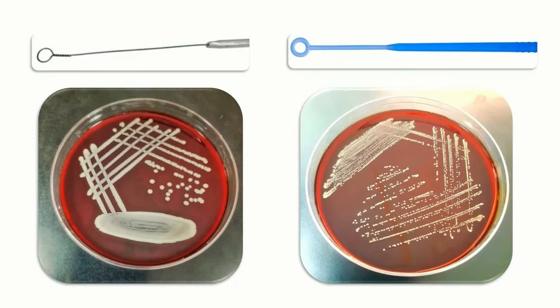After the incubation, you can see the isolated colonies are formed in the third and the fourth quadrant areas of the plate. Thank you.